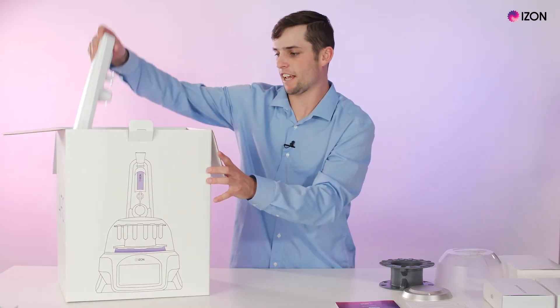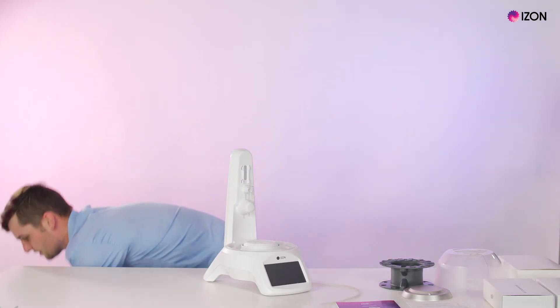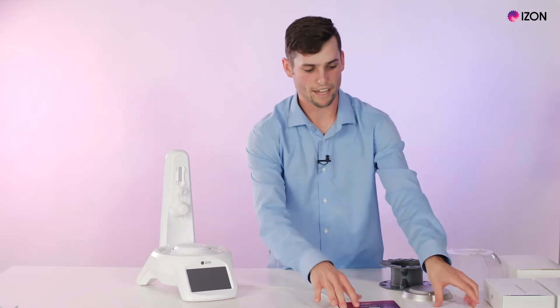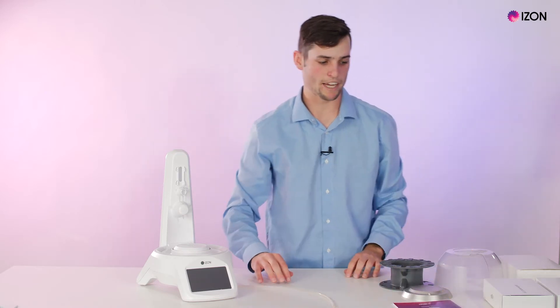Getting the AFC out of the box, we have the AFC. In the box we have the quick start guide and the AFC manual — important material if you want to read through setting up the AFC.